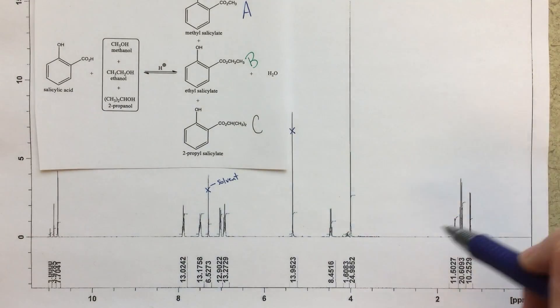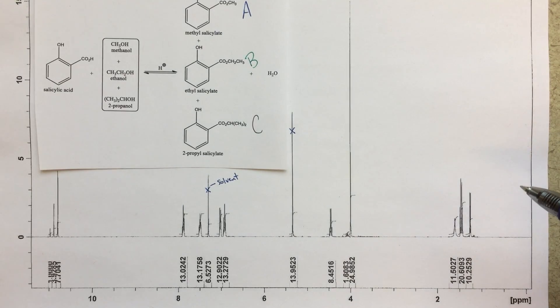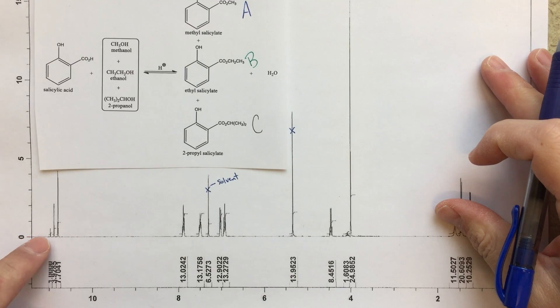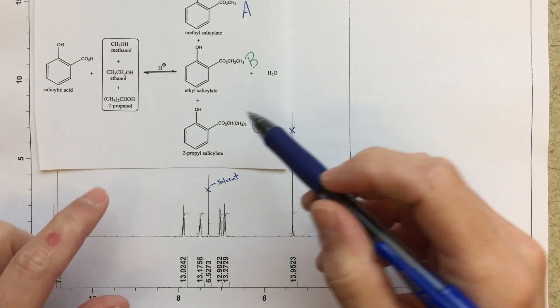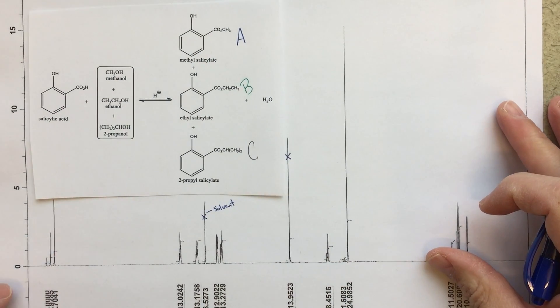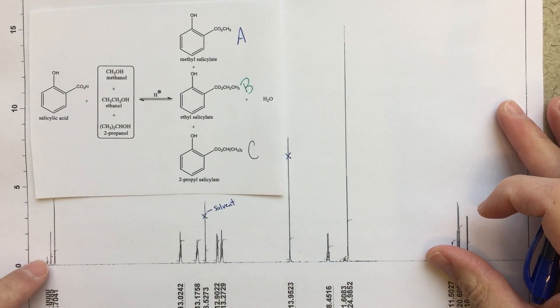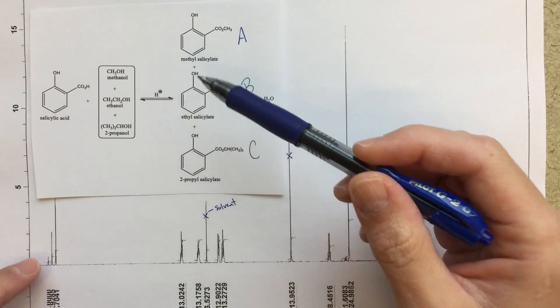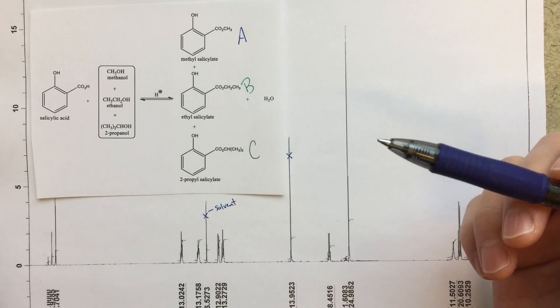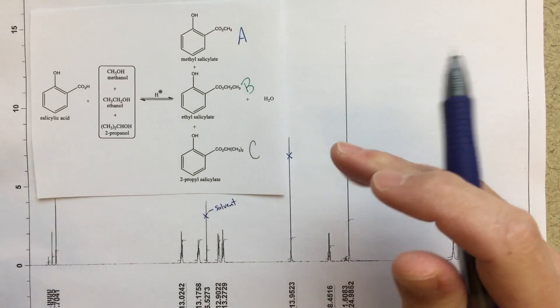So looking at this NMR then, sort of what's left, I think very clearly these three peaks out here around 11, those are going to be my OH peaks, my phenol peaks on my different products. So each one of these is going to correspond to each one of these.